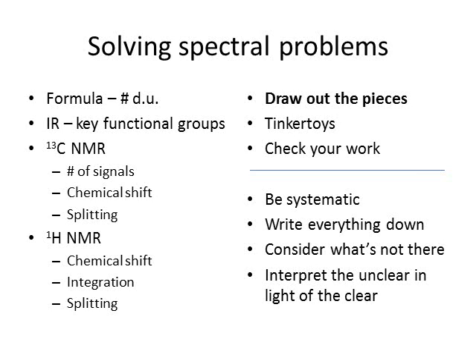I find the people that get very confused by spectroscopy are the ones who are just sitting there with an IR and a carbon NMR and a hydrogen NMR or whatever information they're provided. And they're just sort of staring back and forth, and they don't know where to start. I think if you work through, you look at each spectrum in turn and write down, that's my next point, write things down. Don't just try and keep it all in your head, but actually write down, oh, this signal is a CH3. This signal in the IR tells me that I've got an OH, or whatever.